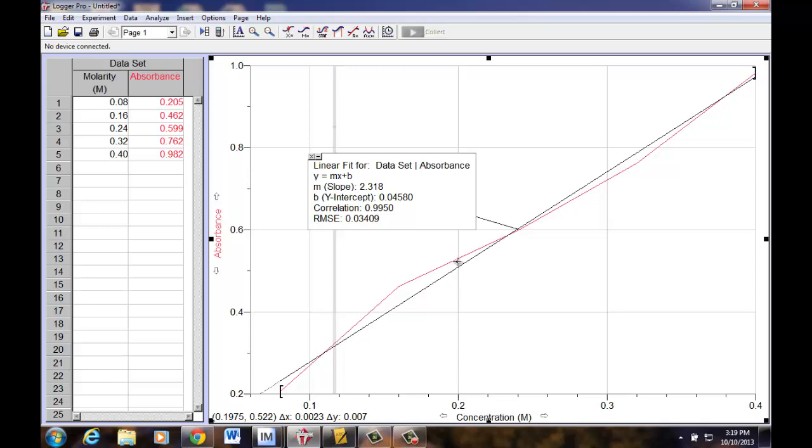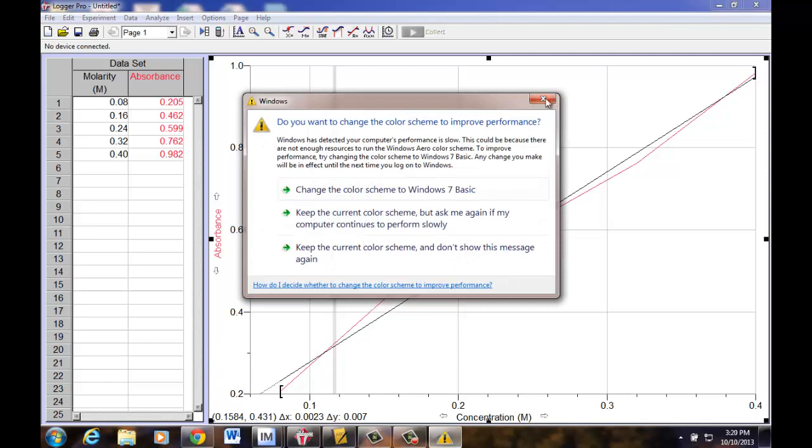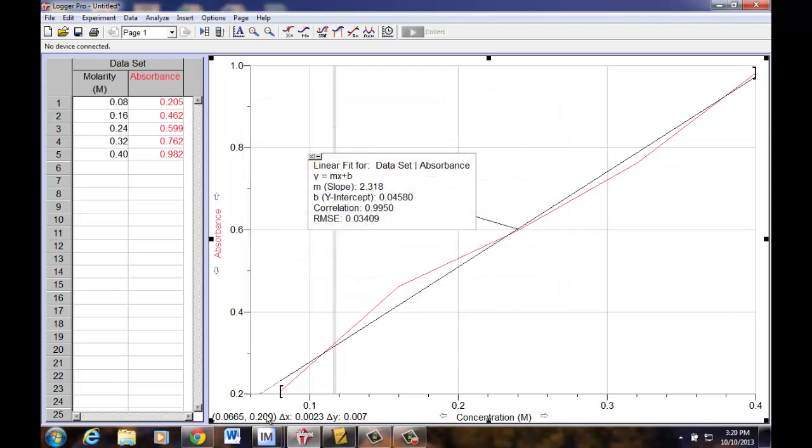There, right there. 0.525 is the Y, and again, notice where I'm looking. The cursor is on the red line, and what I'm hoping to do is just bring your eyes right here, where the X and the Y are. So here we go. 0.525, and I just want to simply read what the X value is at that time.